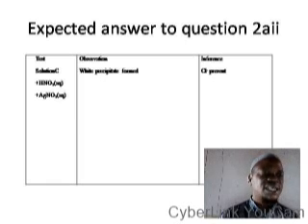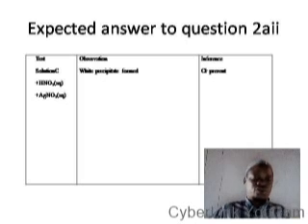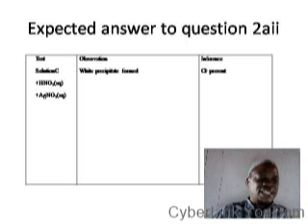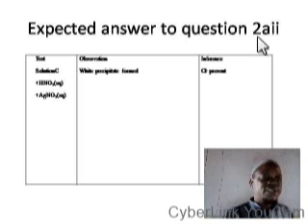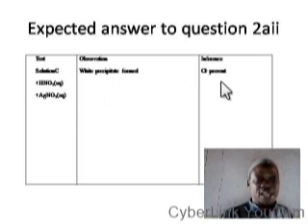Nobody has asked you to add silver trioxonitrate(V) solution in drops till excess. It's only in drops, so you have to add in drops. Some of you will be writing in drops in excess, when the examiner has not asked you to add it in excess. So you just write it there, as we have written it here. It's only when they ask you to add in drops till excess that you are going to write in drops in excess under your test. So please take note of that. So white precipitate was observed, indicating that the solution might contain chloride ion.